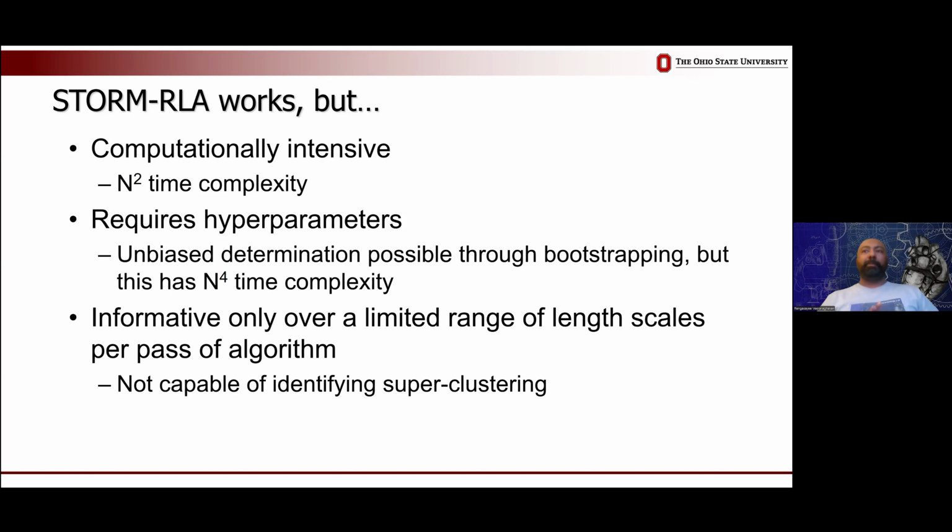For a single paper, we generated a few thousand images. It took about 11.5 months for us to analyze that data set in 2023, which got us thoroughly irritated, thinking we don't want to wait that long after an experiment or a series of experiments to know what happened. The other problem with this algorithm, it only gives you information on a narrow range of length scales based on the parameter value that you put in.